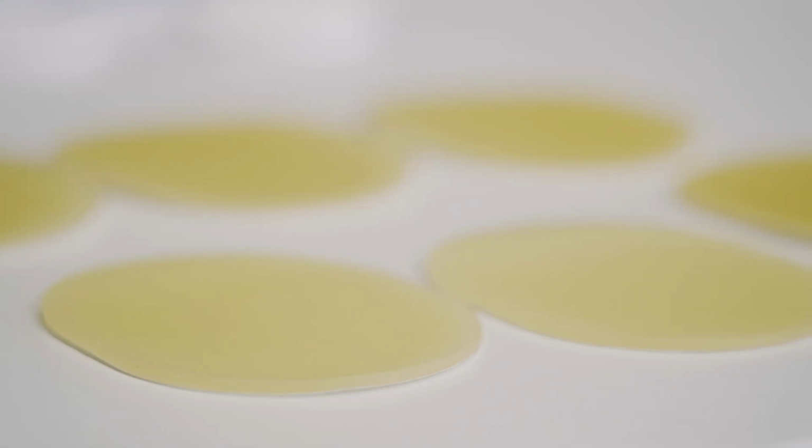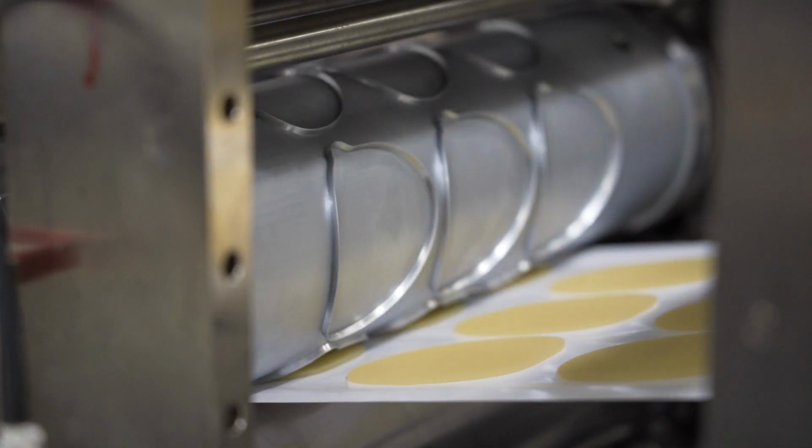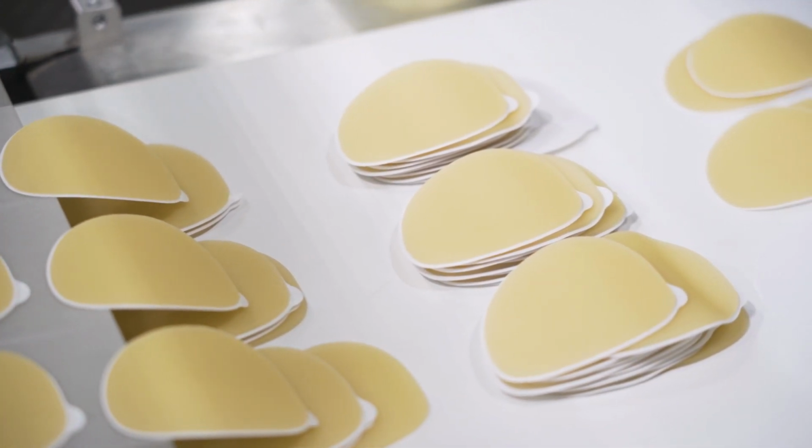Lastly, we have hydrogels, which are gaining traction in biological and tissue engineering applications due to their structural similarity to natural cellular environments. These highly porous materials can be modeled with microchannels to deliver cells, nutrients, or reagents, making them ideal for studying cell cultures. Because they're non-toxic and support diffusion of small molecules, hydrogels are well suited for applications requiring close interaction with living tissues. While their strength is lower than other polymers, their biocompatibility and tunable pore sizes make them valuable in regenerative medicine and biomimetic microfluidic research.